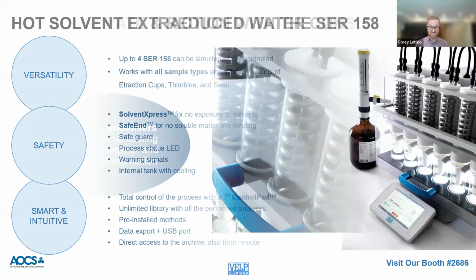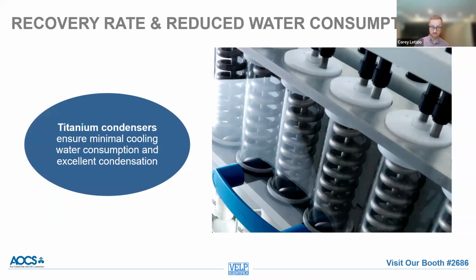Now, the last thing I'll mention that's really unique about our system are our patented titanium condensers. Now, this ensures minimal water consumption and condensation, but it also leads to a more efficient extraction, right? Titanium is going to have a higher thermal conductivity than glass. So that's going to lead to a more efficient extraction over time with some of those samples.